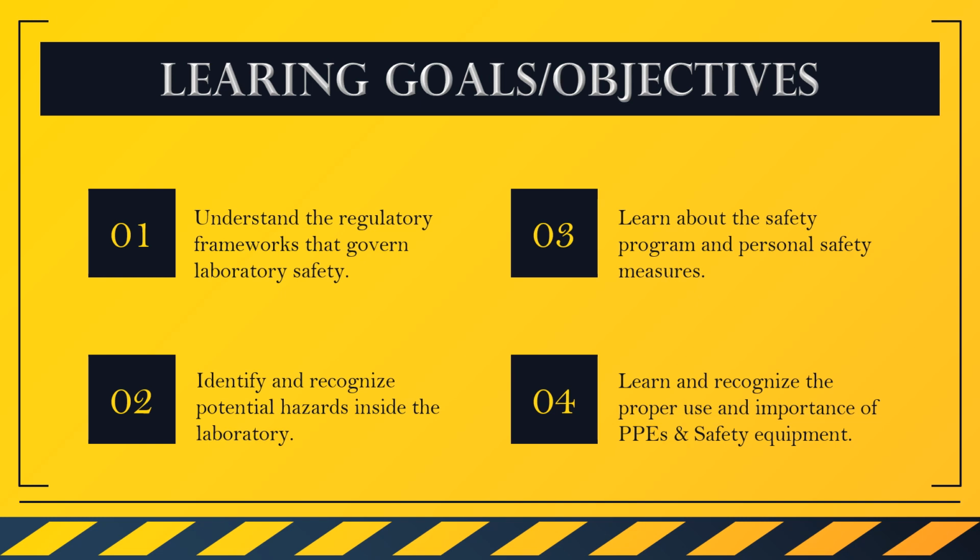So after the presentation, you are expected to understand the regulatory frameworks that govern laboratory safety, identify and recognize potential hazards inside the laboratory, learn about the safety program and personal safety measures, and learn and recognize the proper use and importance of personal protective equipments and safety equipments.